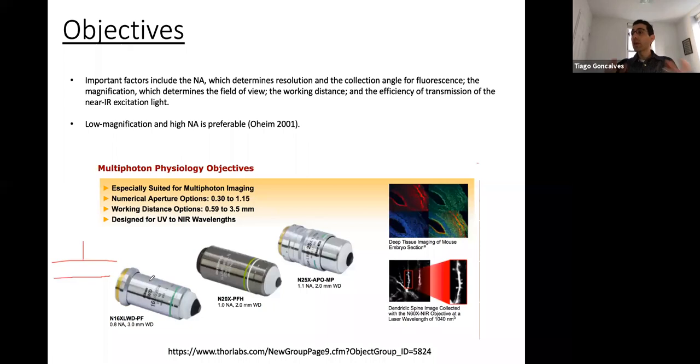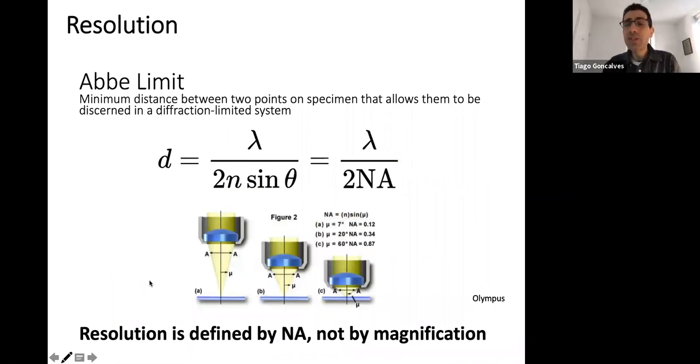And if you don't expand it enough, then the size of the point that you'll excite will be bigger and bigger, and you lose your resolution. So what is your resolution? What is the minimum? And this is, Arvind, kind of related to what you were asking.